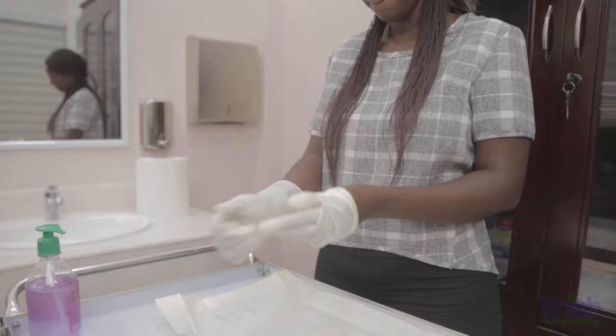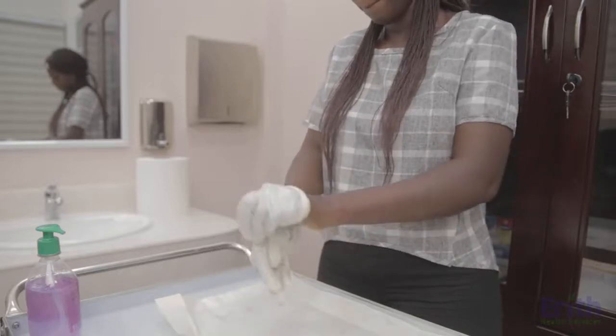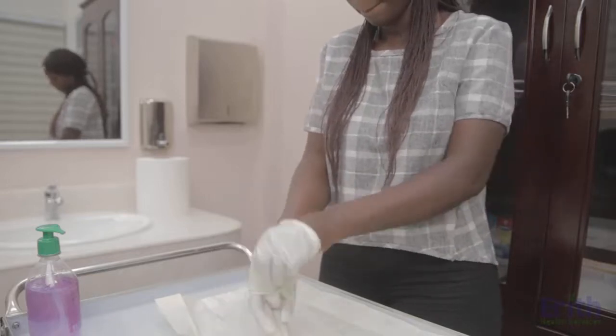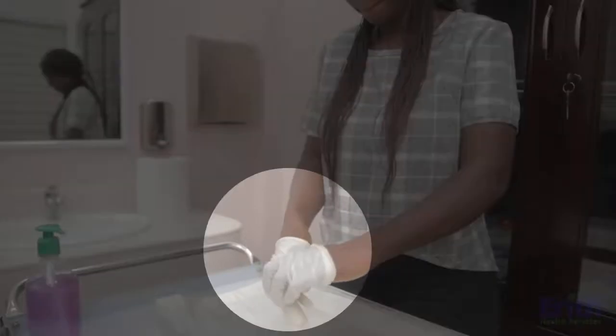Step 2. Leaving the first glove over your fingers, grasp the second glove near the cuff and pull it part of the way off. The glove will turn inside out. It is important to keep the second glove partially on your hand to protect you from touching the outer surface of the first glove with your bare hand.